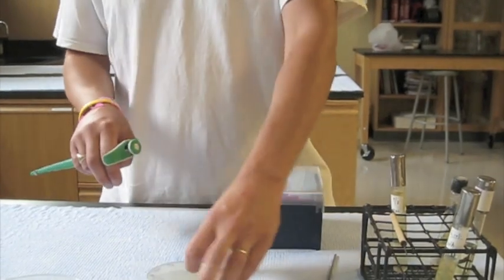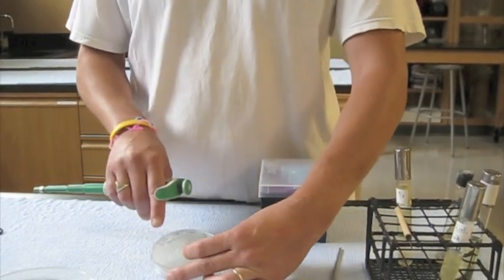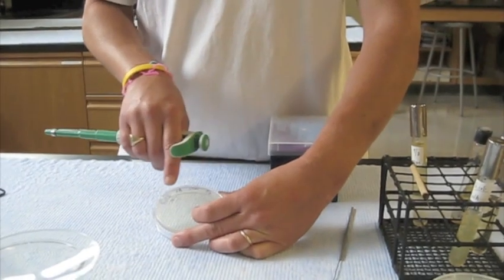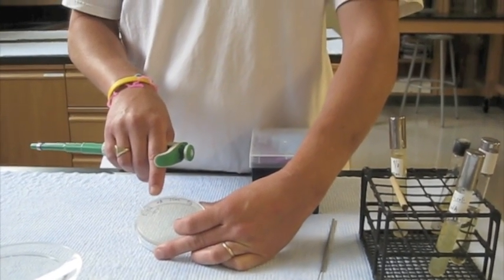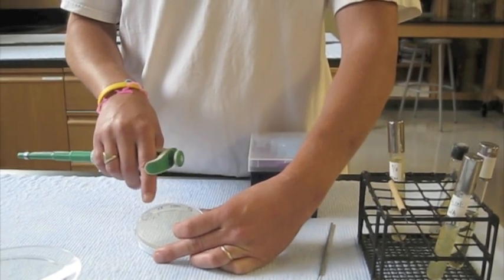I've already labeled my plate with the bacteria that's on there, the media, my initials, the date. And in this case, because I'm going to do a one-tenth dilution, it's labeled 10 to the minus first.